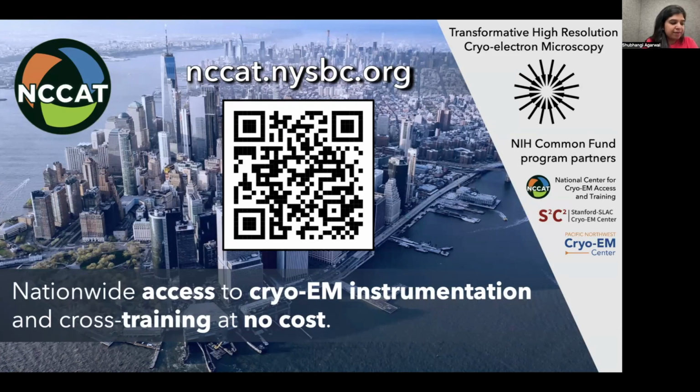On the instrument side, we are upgrading some of our instruments with the newest energy filters and direct electron cameras, Selectris and Falcon 4i.